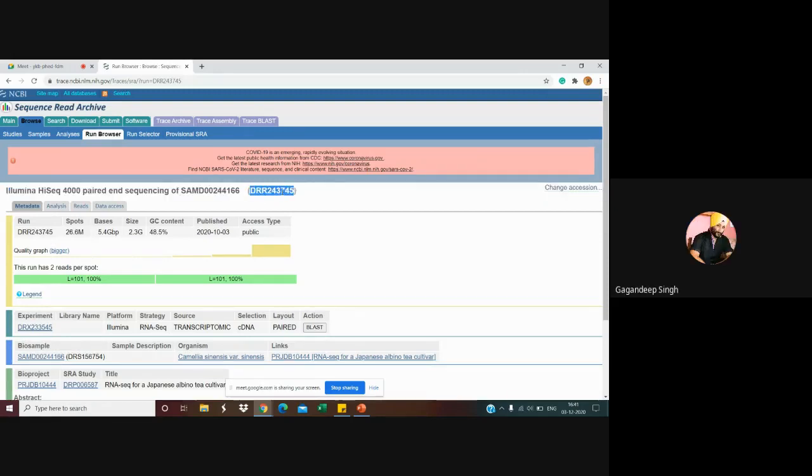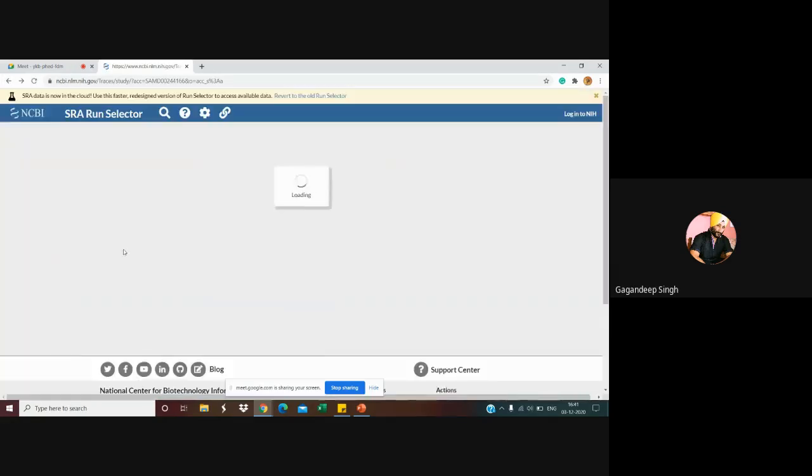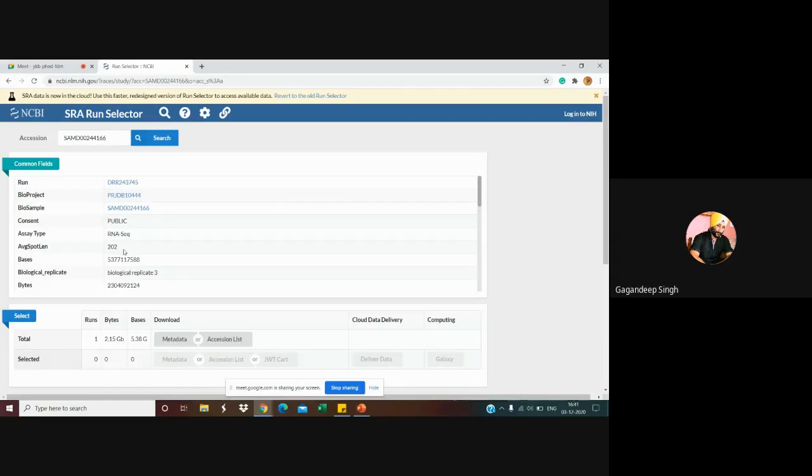Just click back and copy that run. DRR243745. Just copy this. Not the link address, just copy the whole text. Okay, now click on this only.